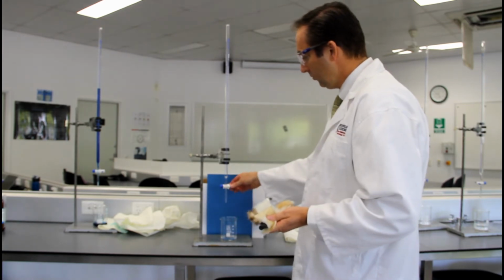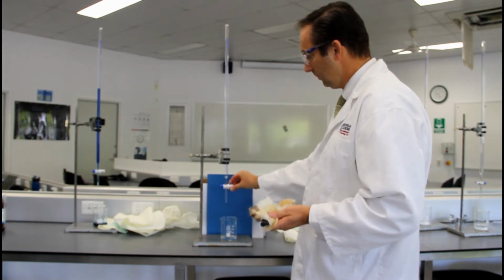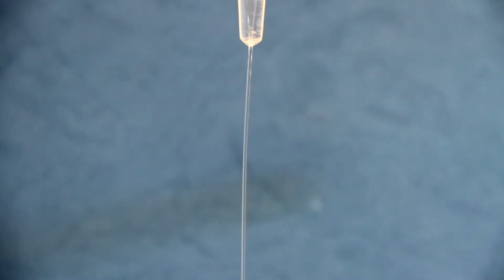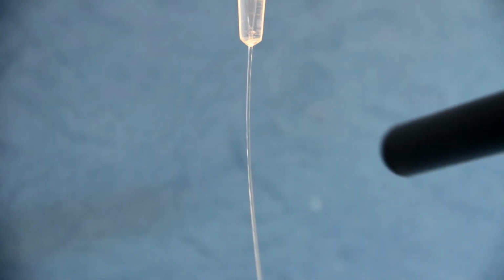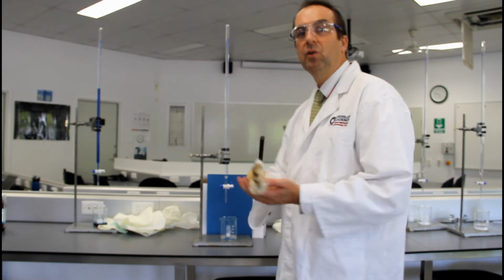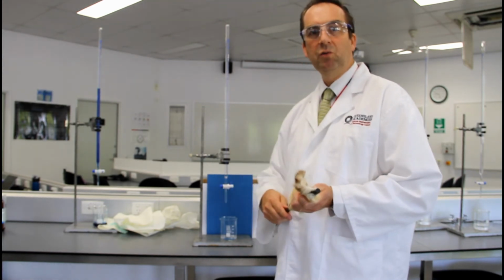So I will start the stream here, and as I charge up the rod and bring the charge close to the ethanol stream, you can clearly see that the attraction is incredibly strong. In fact, it almost does a 90-degree turn due to the charged rod.